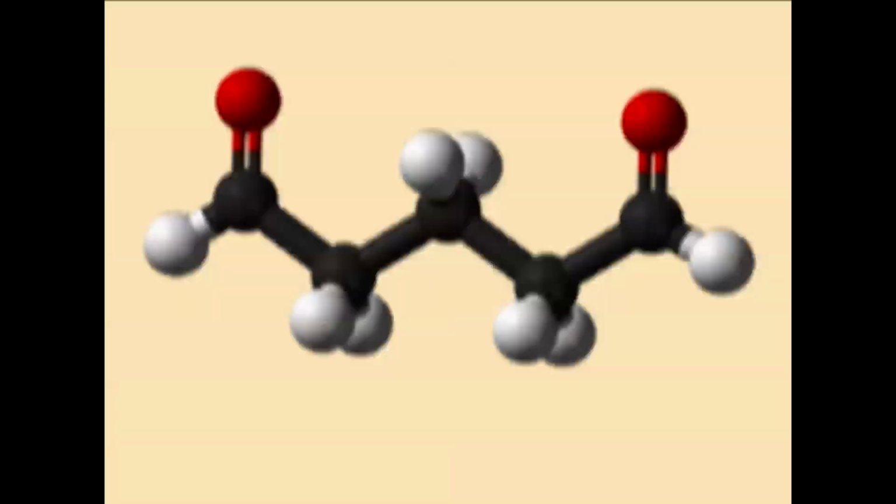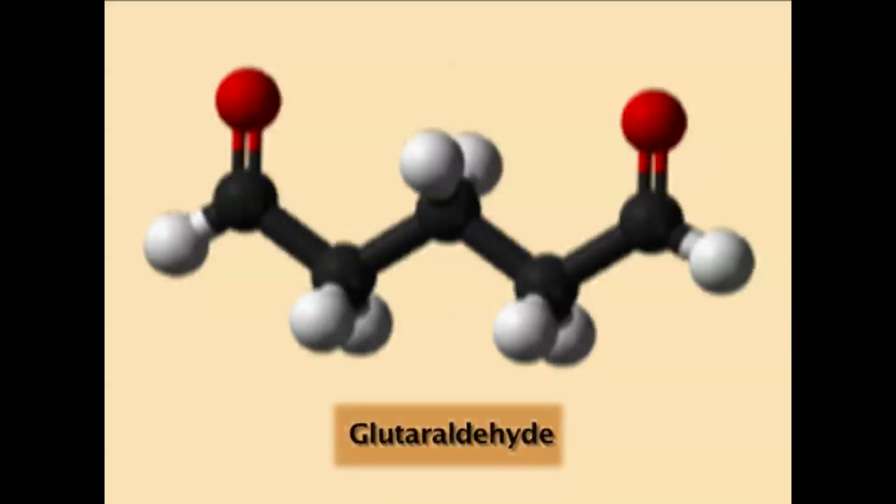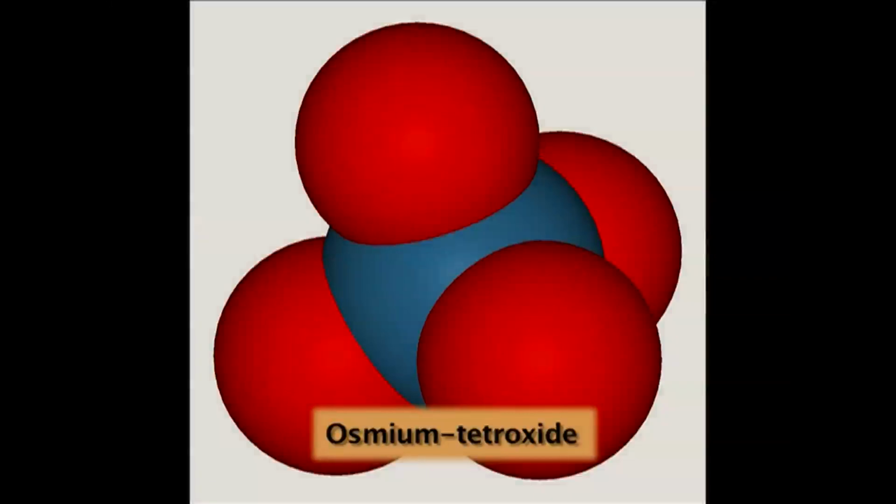As I was discussing, sample preparation for biological specimens is of utmost importance. So first, the sample needs to be fixed. Glutaraldehyde and paraformaldehyde or a mix of these can be used. Even osmium tetroxide is also used as a good fixing agent.